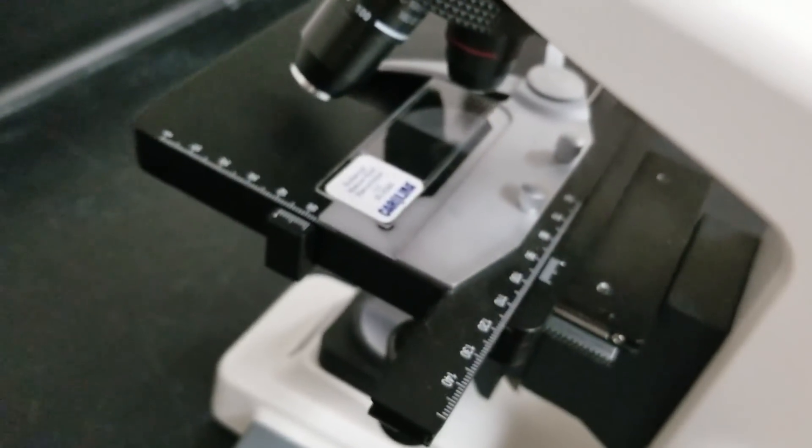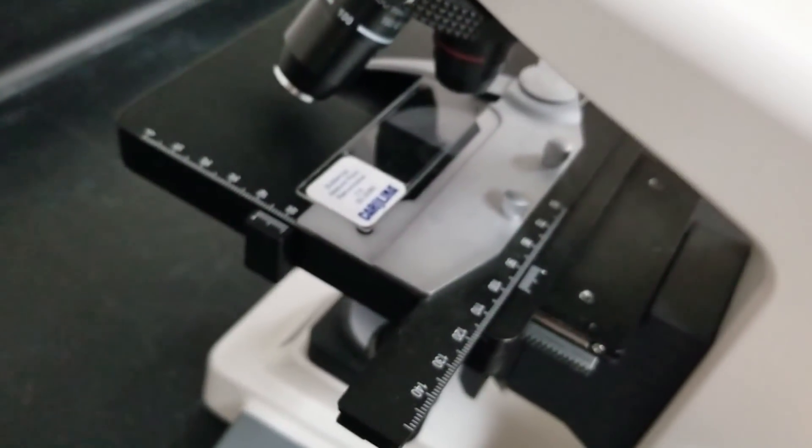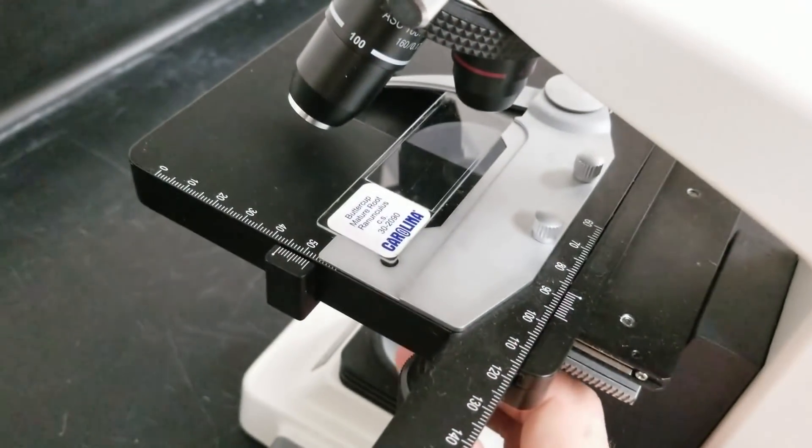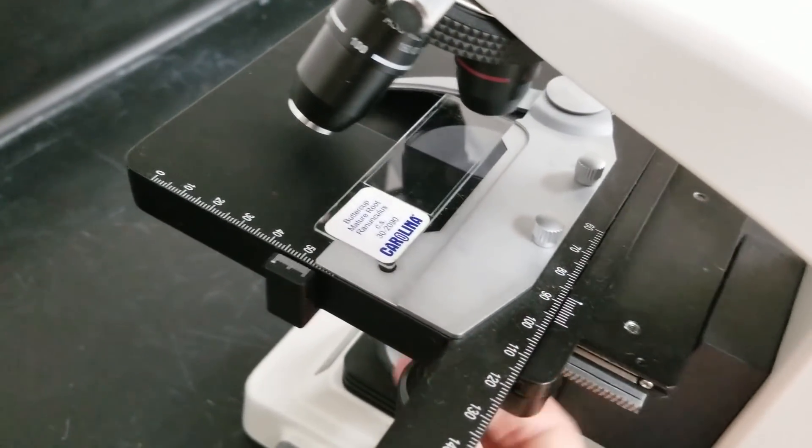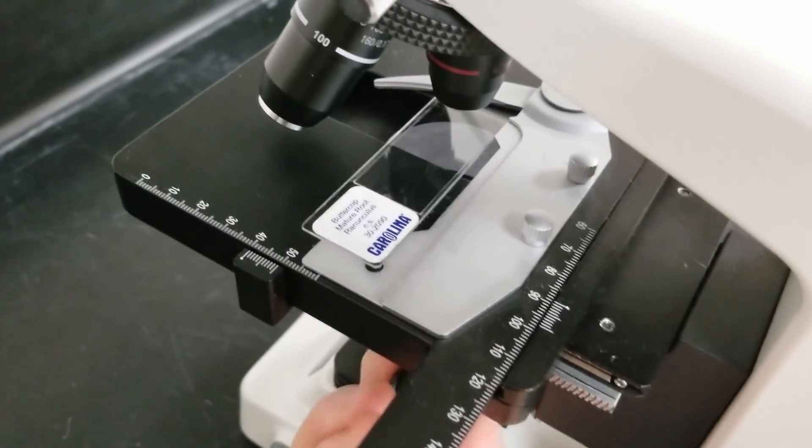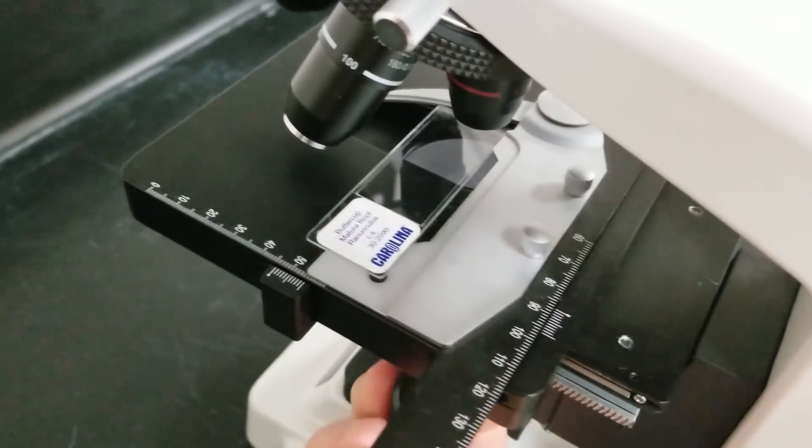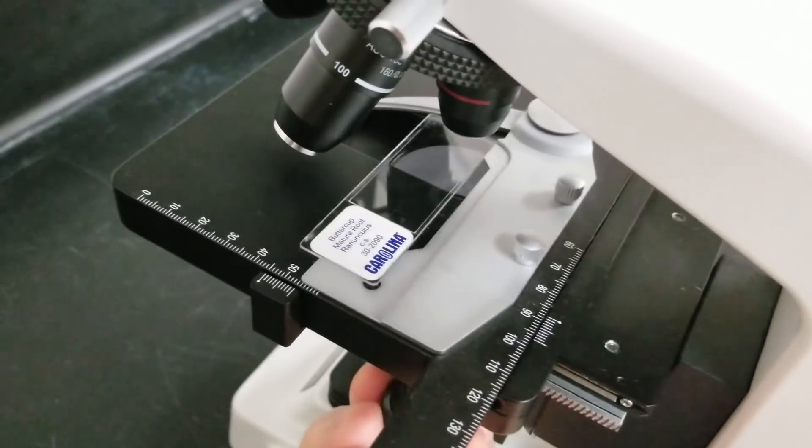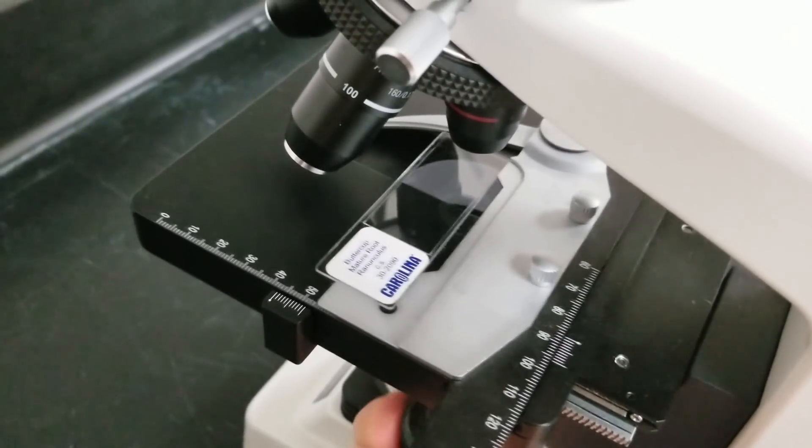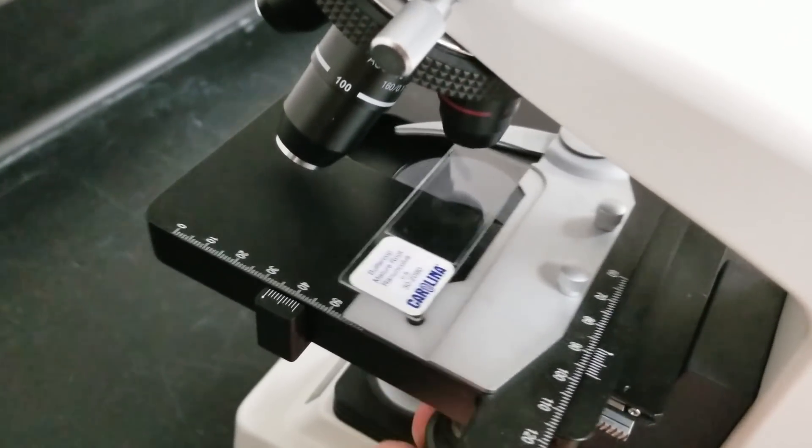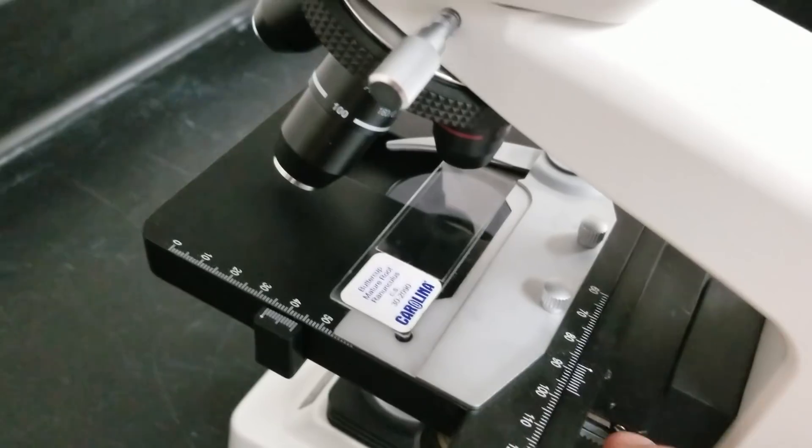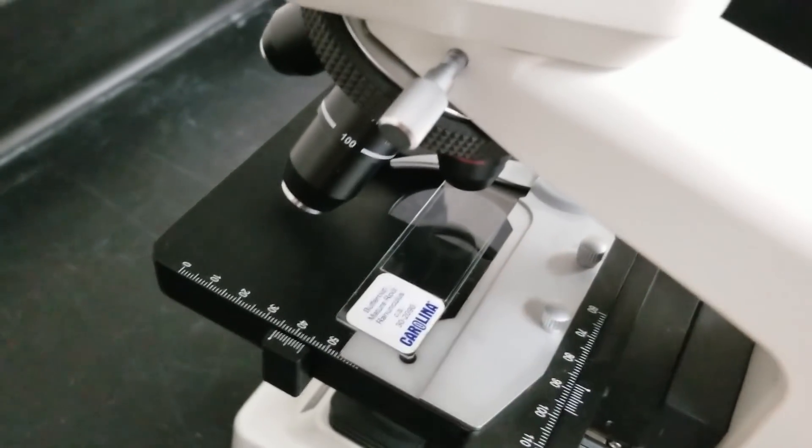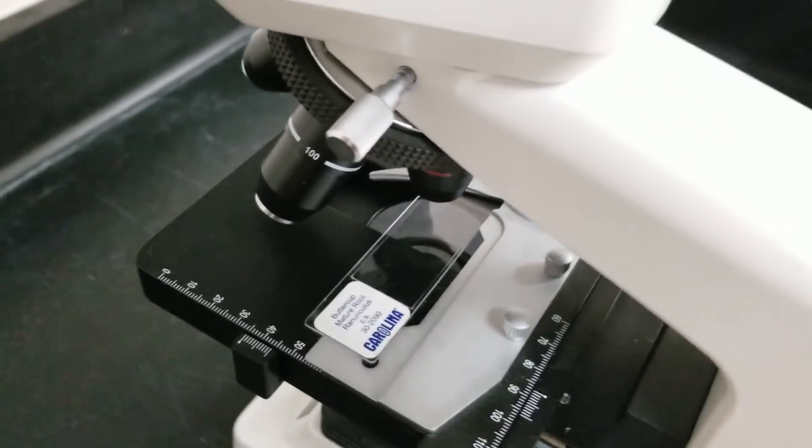Now it is snug. So when you move the actual stage, the slide will move with it. If the slide is not moving with the stage then it's not going to work. Make sure it is snugly attached here in the stage.